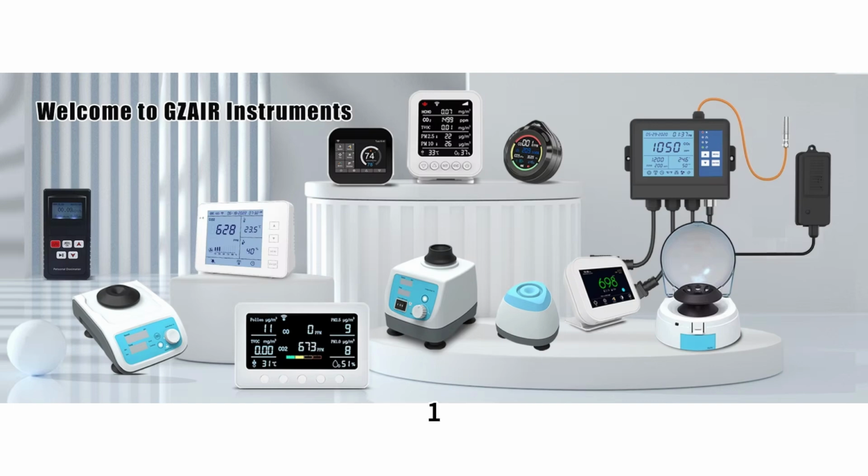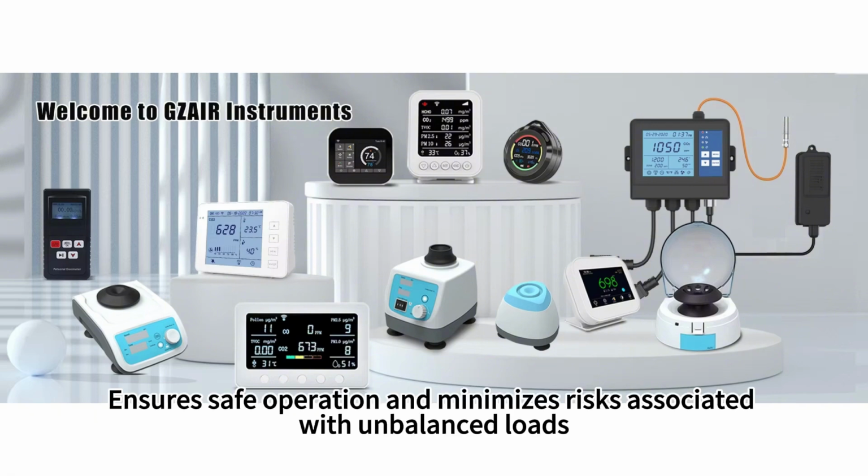Safety features: 1. Includes lid locking mechanisms, imbalance detection, and emergency stop buttons. 2. Importance: Ensures safe operation and minimizes risks associated with unbalanced loads.